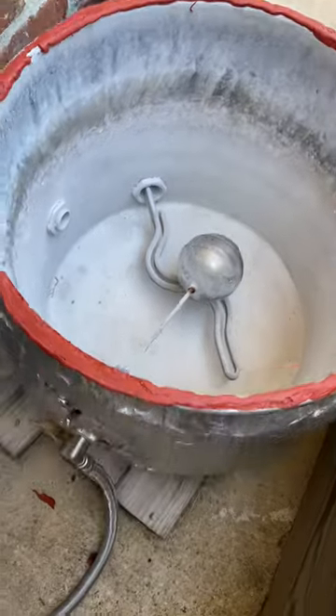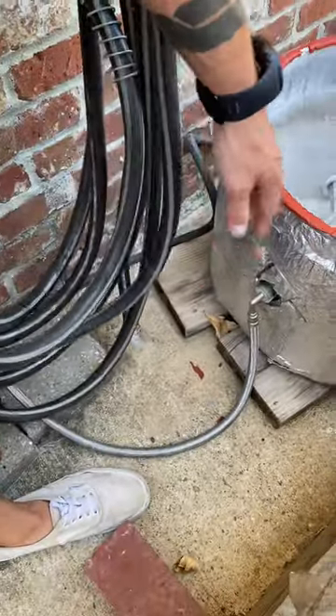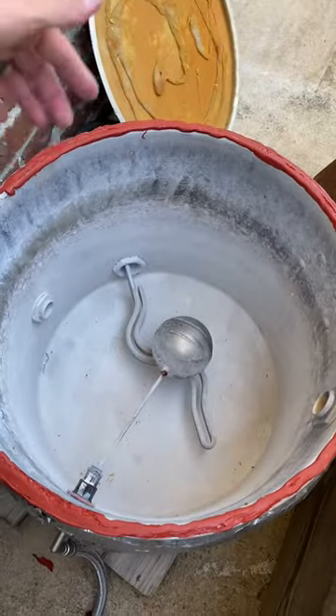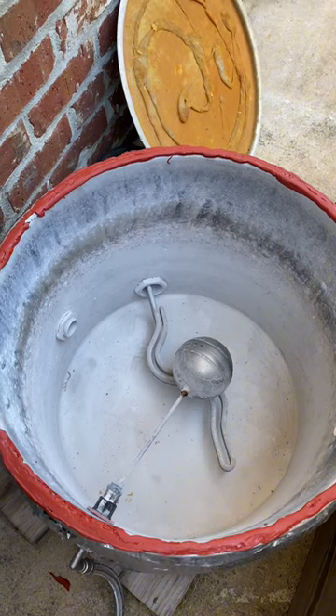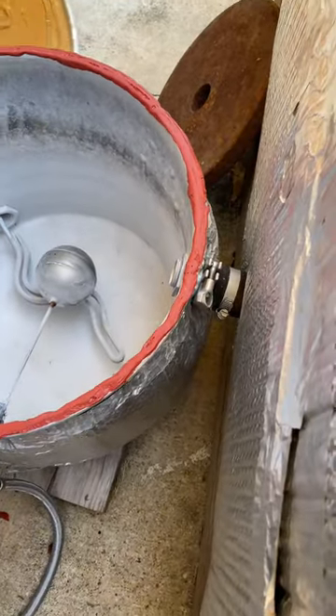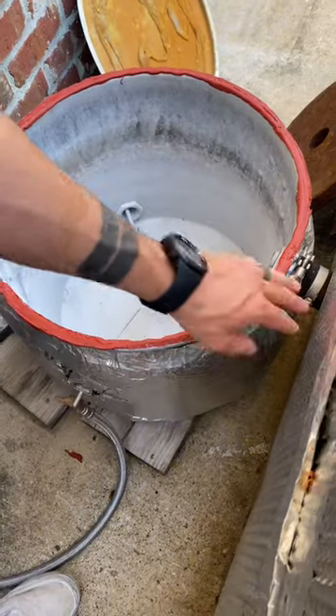We have braided cord here because you don't want water flowing in through a regular hose — you'll melt it. This gets extremely hot. There's a stainless steel float valve in there and a heating element, both off Amazon. We have RTV around this edge so there's a good seal when we put the lid on. This is just a big pot with insulation wrapped around it.